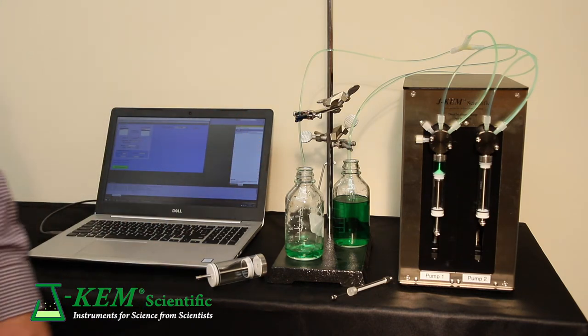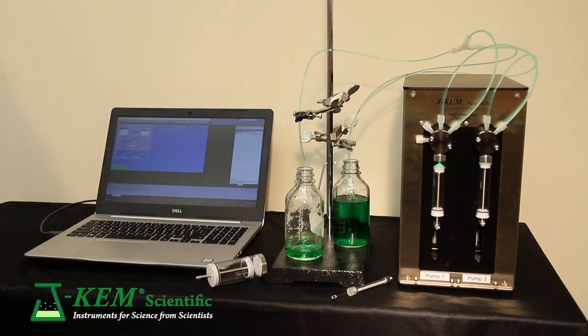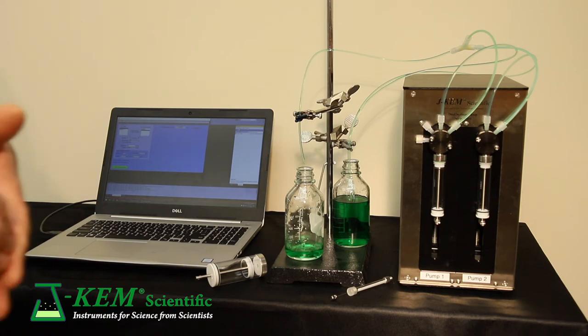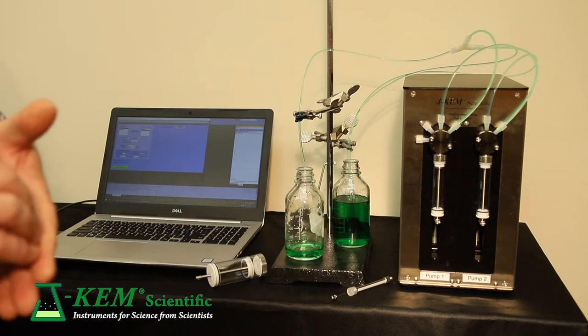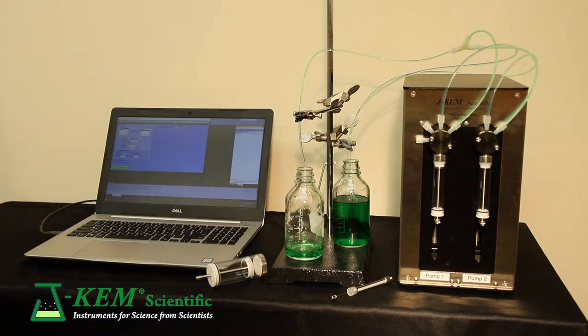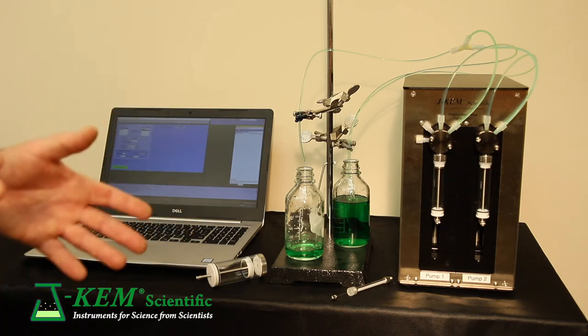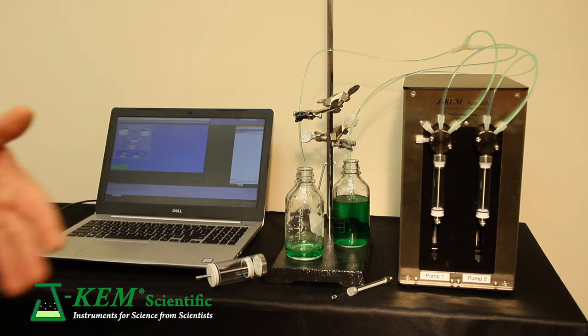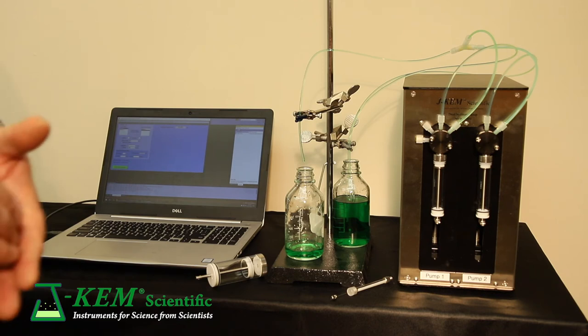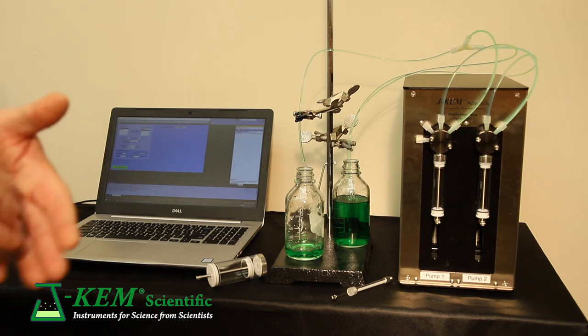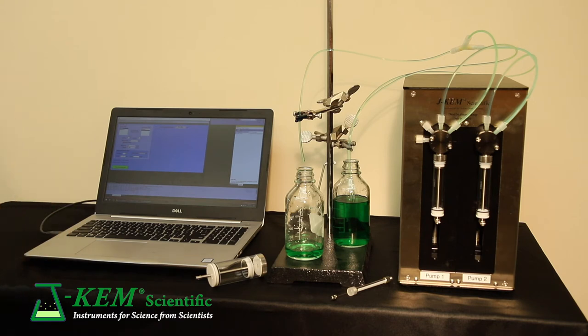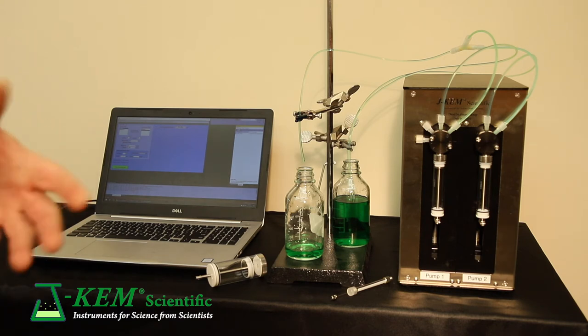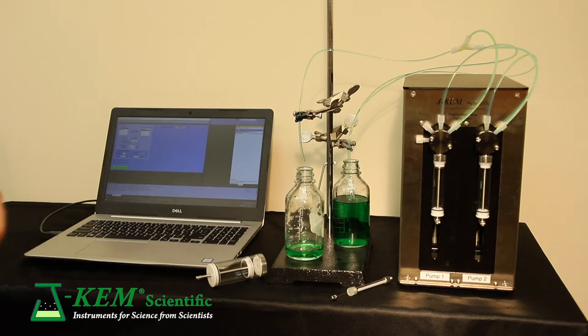In most cases, that's not really important. For example, if we were dispensing at a rate of one milliliter a minute, which might be a little more practical, then you would deliver for 10 minutes at one milliliter a minute. The syringe would then have to stop for about six seconds. It usually takes four to six seconds to fill a syringe. So it would stop for those six seconds while it refilled. And then once it was full, it would resume its delivery. In most cases, that short pause in refilling is fine and most chemists can use the single position syringe pump.